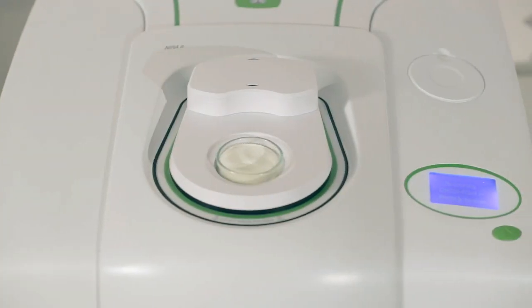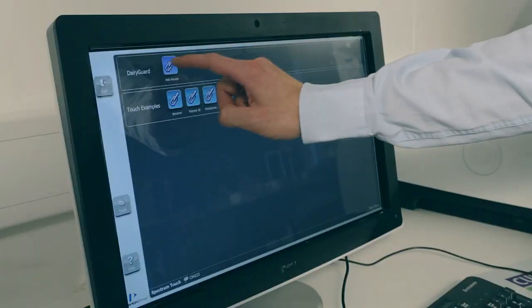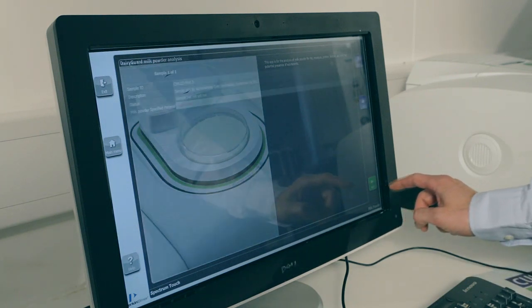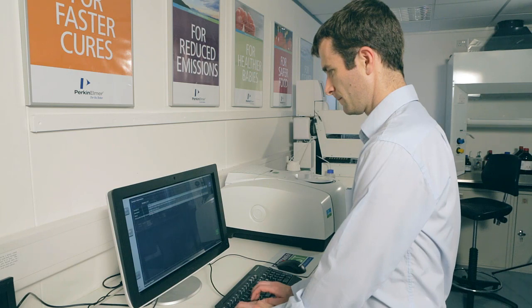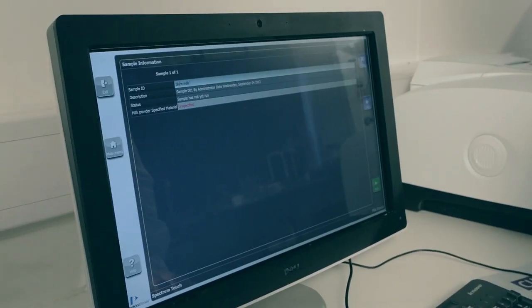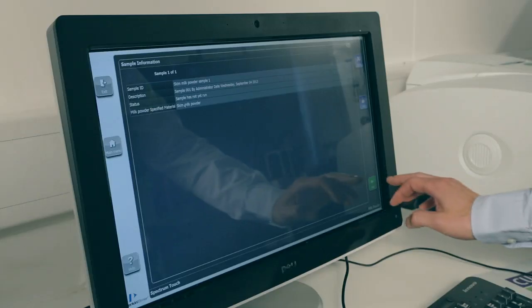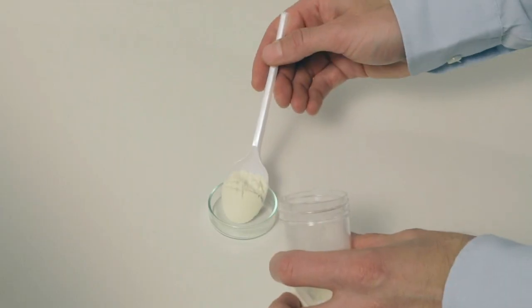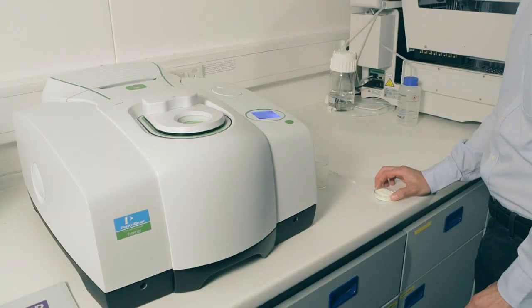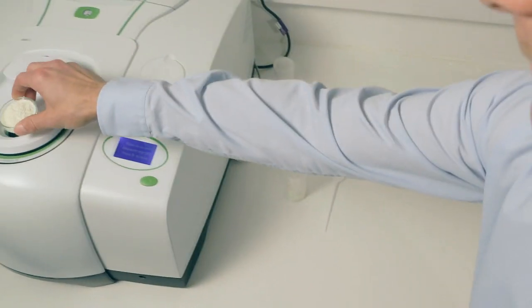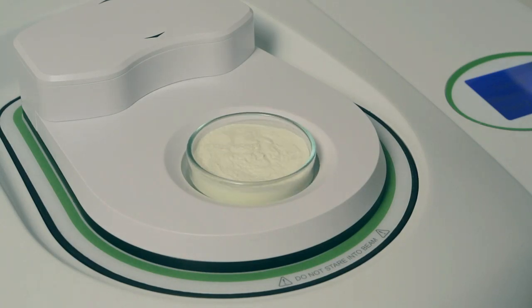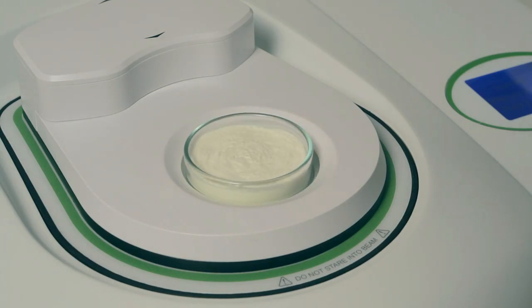So let's take a look at how easy it is to use. First, press the appropriate app icon in Spectrum Touch software. The first screen displayed is an introduction screen, so press next to continue. On the sample information screen, we enter the name of the sample and designate the sample type as either skim milk powder or whole milk powder, then press next to continue. The next screen displays sample preparation instructions. All we need to do is transfer some milk powder to a clean glass petri dish, tap the dish to level the sample, and then place the dish on top of the sample spinner. Then press the go button on the instrument to start the scan. The system will scan the sample and then calculate the results for the qualitative, quantitative, and adulterant screen methods.